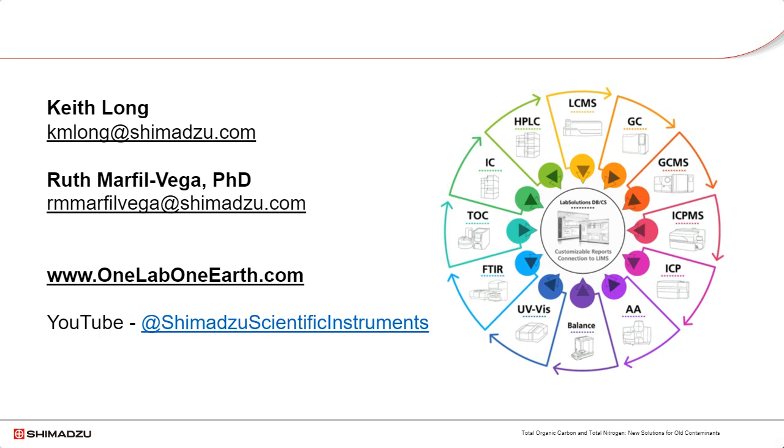Yes, thanks. Yes, the new LabSolutions software can be used with any TOC-L instrument. Additionally, what was the second part of the question, Ruth? Is the software very different from the old ones? So no, the software is not different.